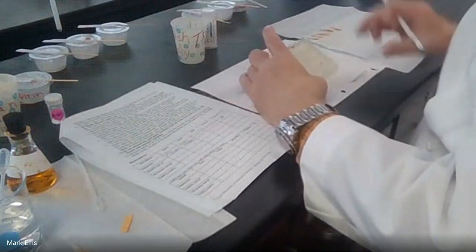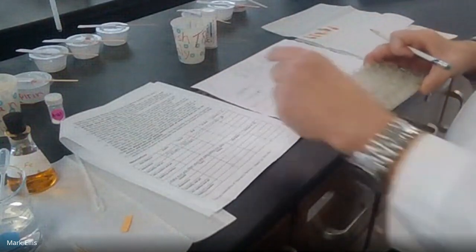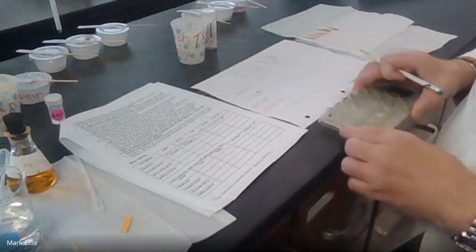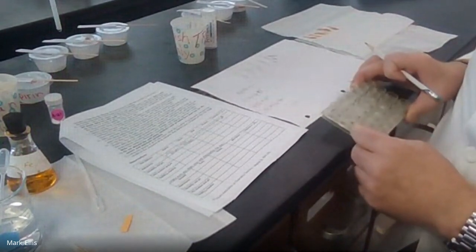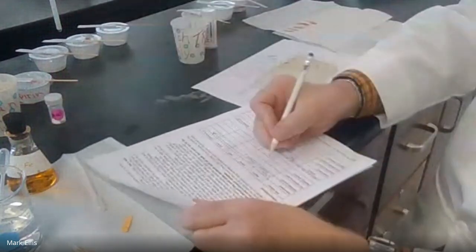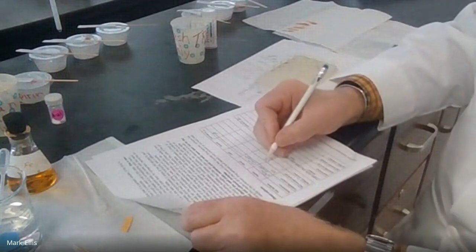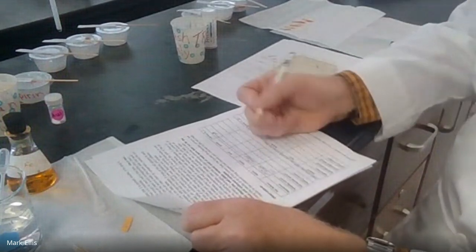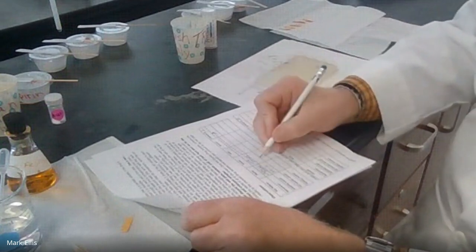And the solubility, it says in the lab how to judge that. Since we got a white background, it doesn't show up too well on the white background. So I'm going to slide it out over the black desktop, and they're all insoluble. So I'm going to put insoluble, and the pH for the aspirin was about 1 to 2. It doesn't have to be exact. Let's just say 2 is the pH.